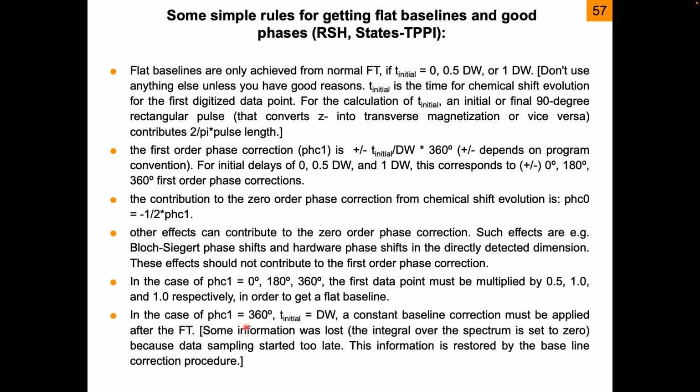And so now you do the phase correction, and that brings everything back into phase, but it assumes basically that at time 0, you have 0 signal.